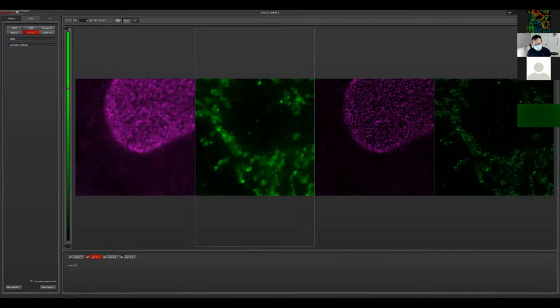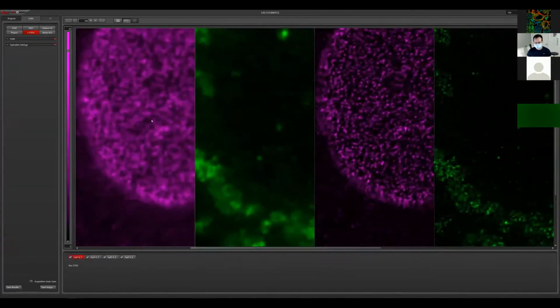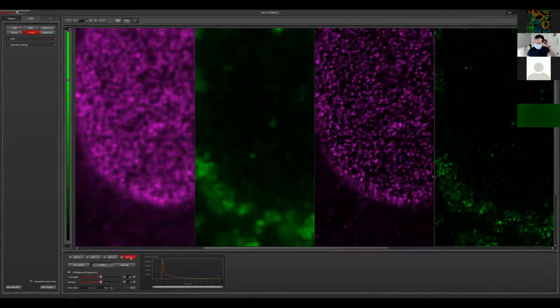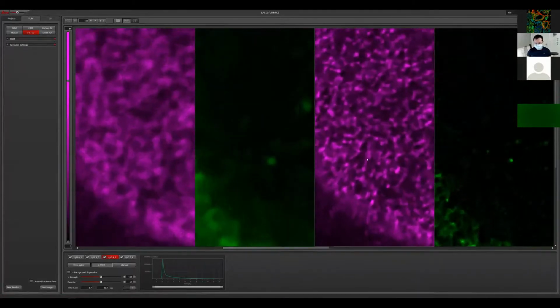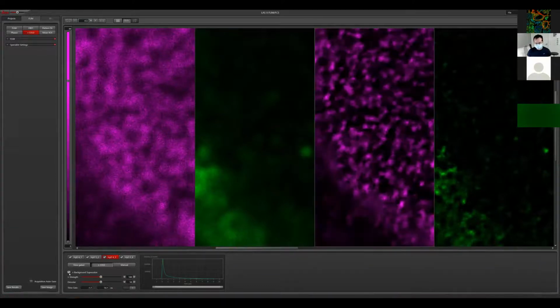What I have proceeded to do here is just a confocal image and a STED image of both channels. So we have 4 images in total. And here you can see that this image actually went better than expected, so I'm really happy with it. And as you said before, the Tau-STED image is immediately calculated. For example, if I disable it, I think people will see really how much it contributes to increasing the contrast in the image. You can really see it here clearly, how it really helps.